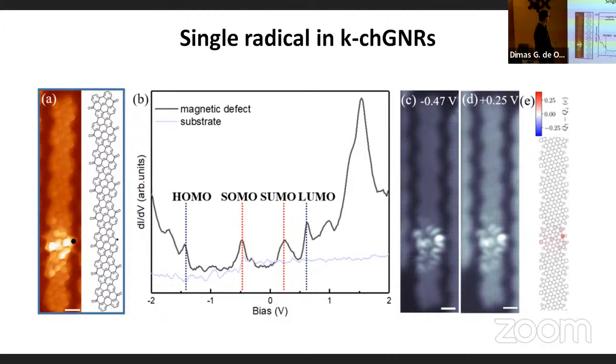And then as you see in our scanning tunneling microscopy image, you see this bright contrast here. As I said before, this is just the fingerprint of this extra pz or unpaired pz electron that is somewhere at low energies. And then this gives us this strong signal. And if you take a conductance spectrum just at this position, then you get a signal like this. And from here, well, you can see this peak here.